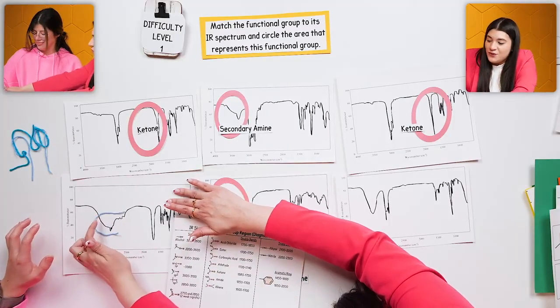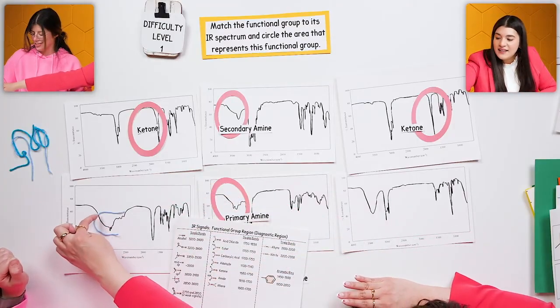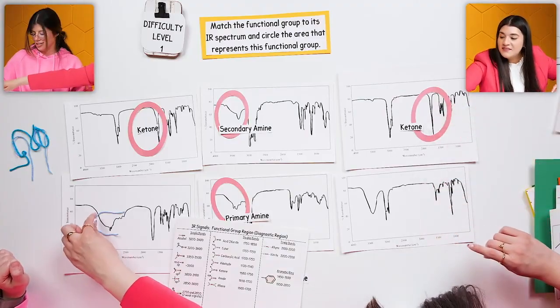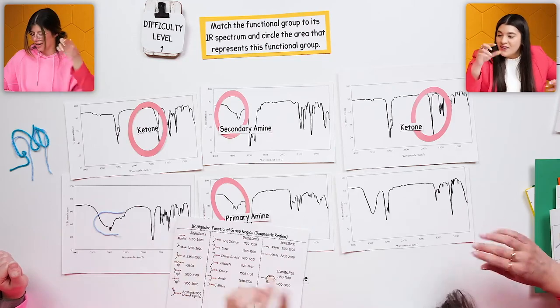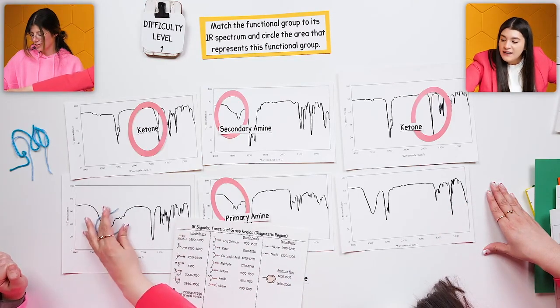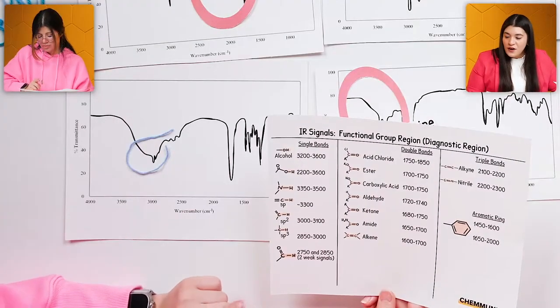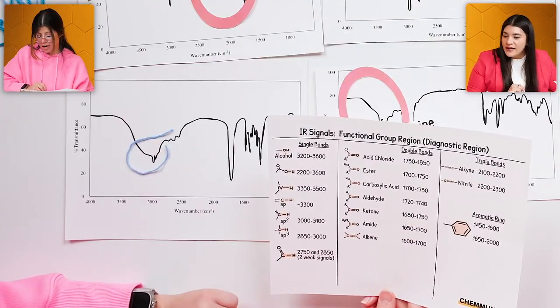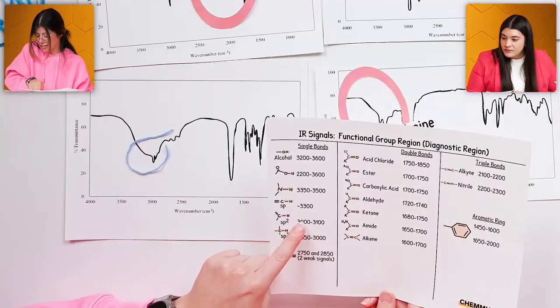So we want this little groove. This is the broad portion. By broad, it's really saying that this was narrow, whereas broad is kind of chunky, with that kind of shape to it. Concavity, so this is the little area that we're looking at. What is within this region? You thought maybe it's between a carboxylic acid or an alcohol. I was thinking that around here would be in the range.